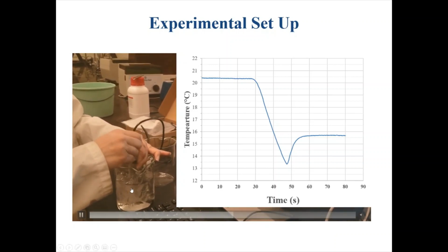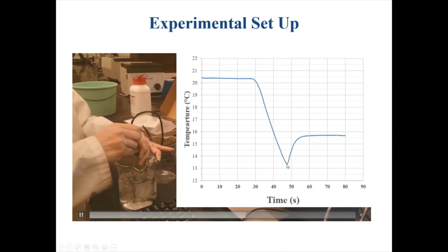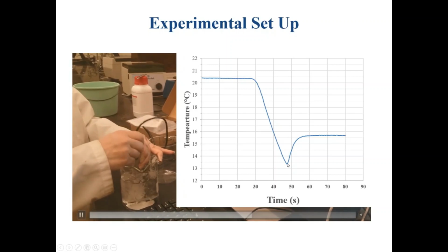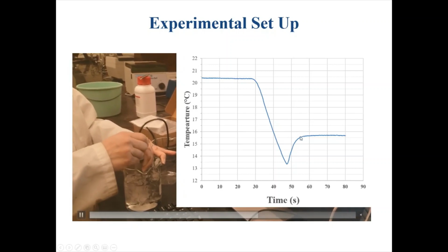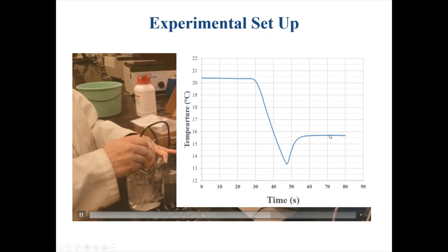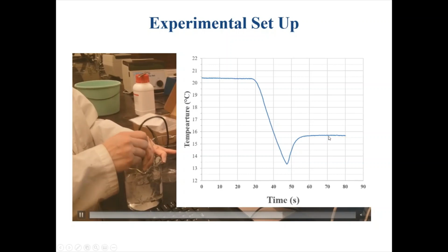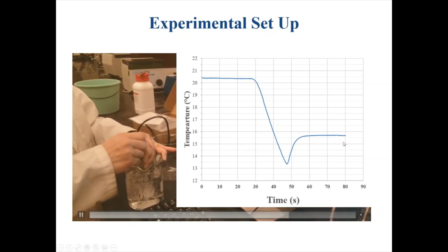Okay, so you saw the instant that it turned solid. At that instant, we get to the bottom of this well, and the minute that solid forms, it jumps back up. Now what she's doing is keeping it in that solution and allowing it to equilibrate. So now we're seeing the freezing point of that pure liquid.